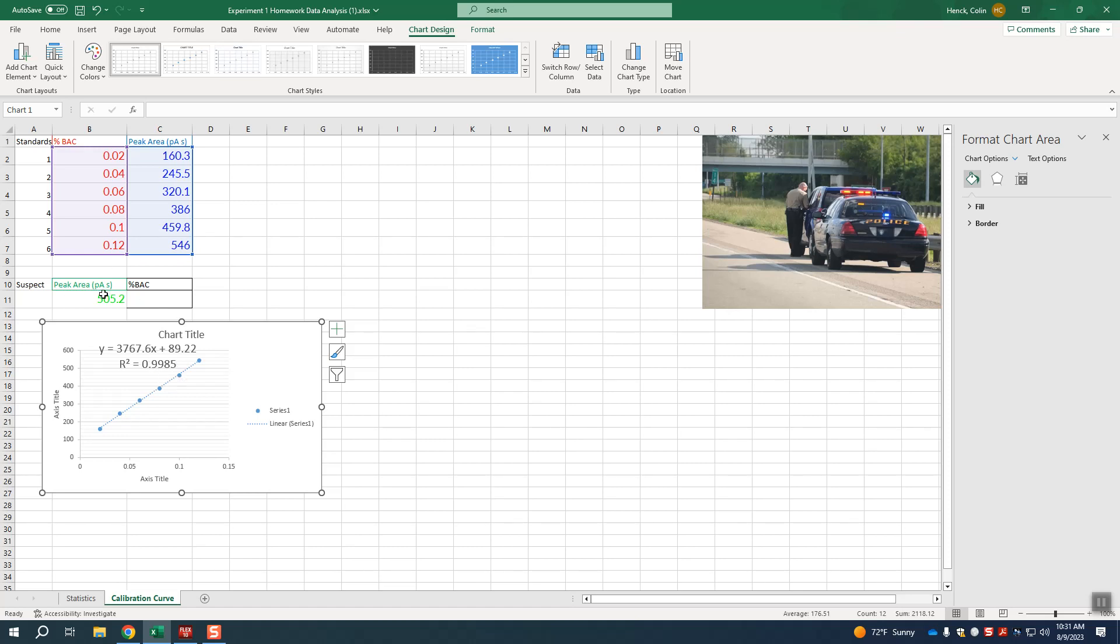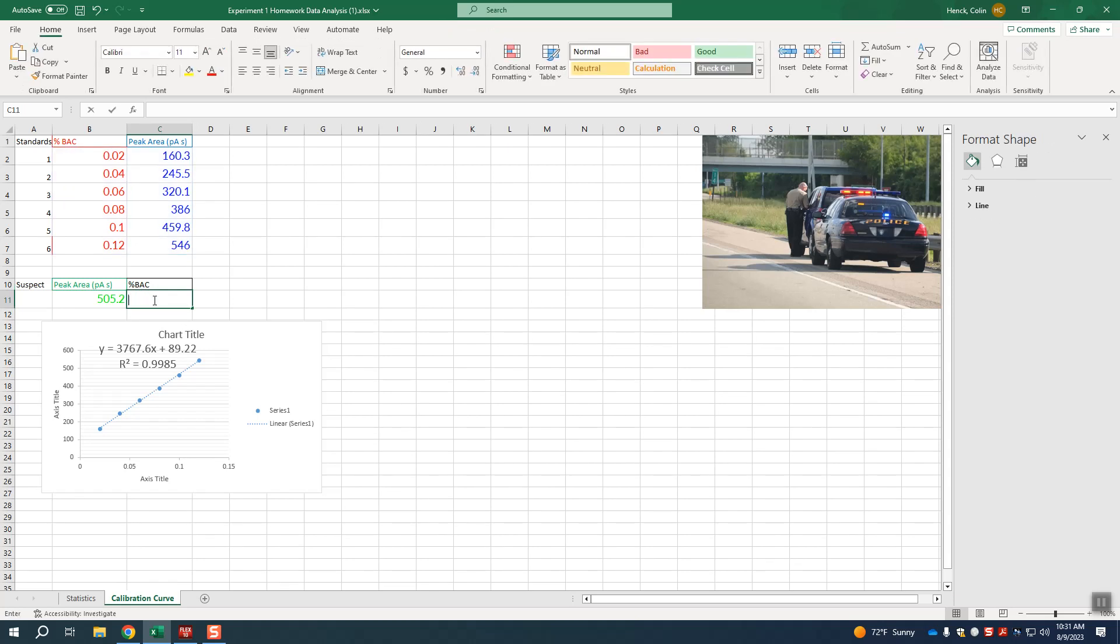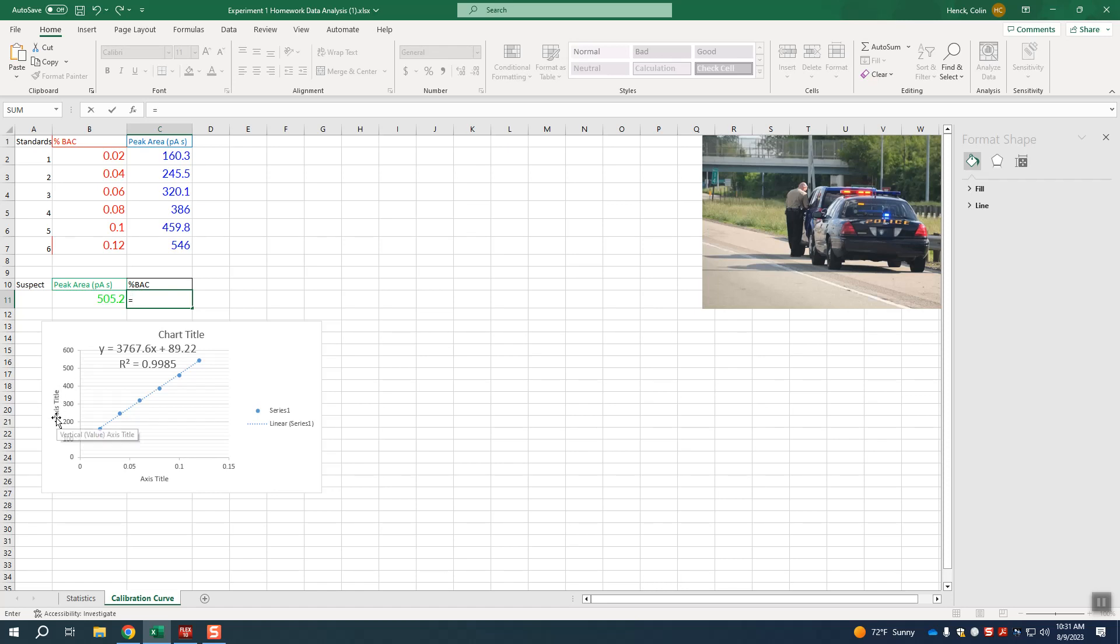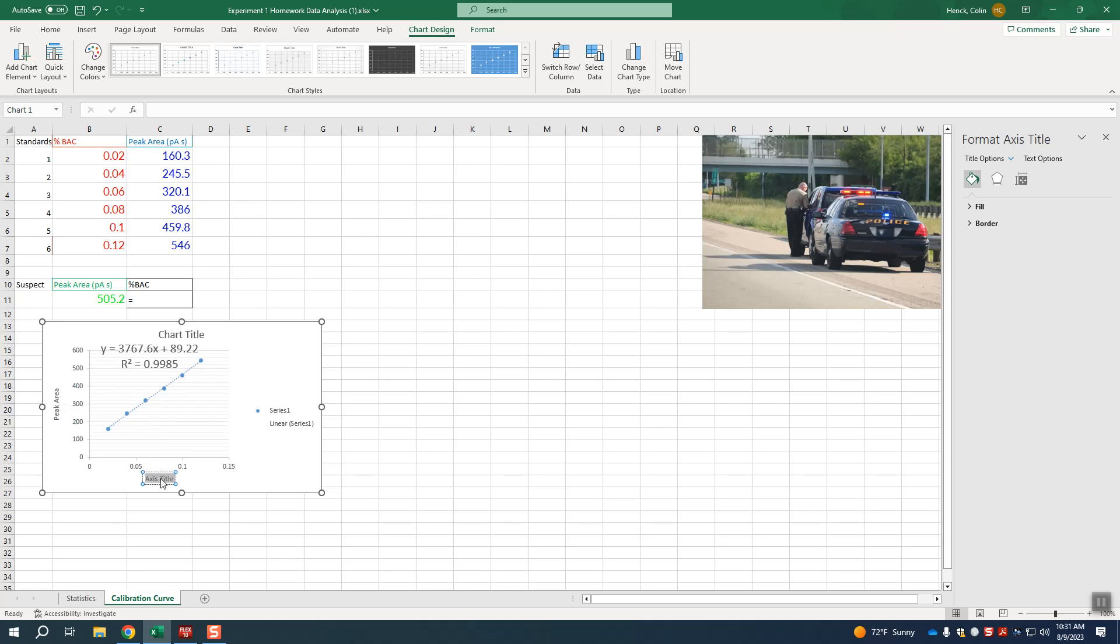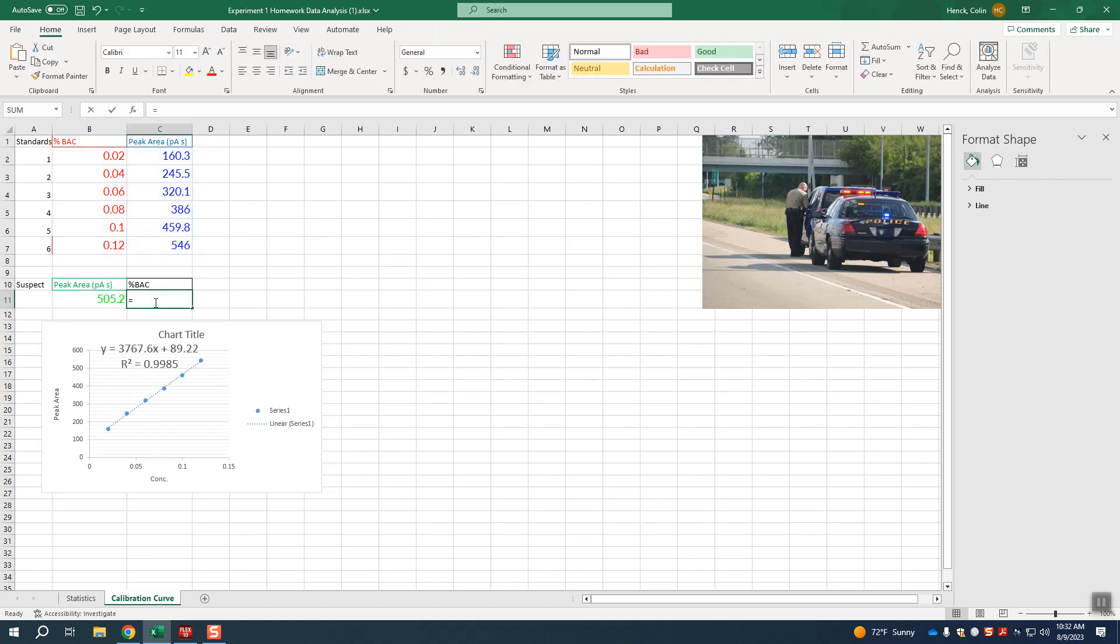Now we need to use this peak area to find the exact concentration of the blood alcohol content. To do that we type in an equal sign to do math. This is a y-value. How do I know that? Because my peak areas are on my y-axis, and my concentrations are on my x-axis, and normally we'd label these with units but I'm trying to keep this video pretty short.